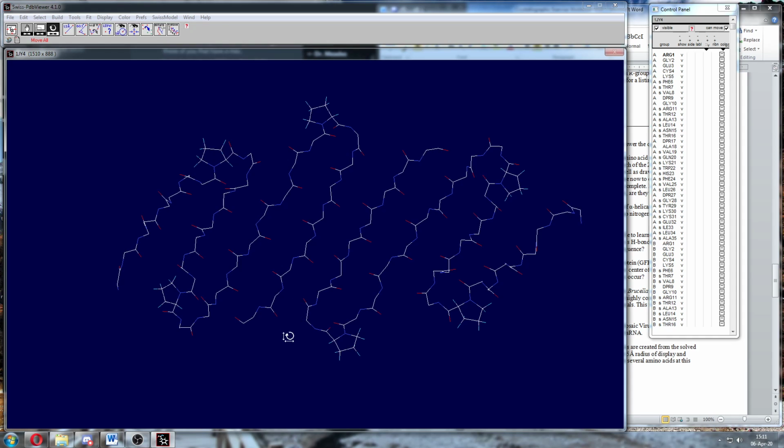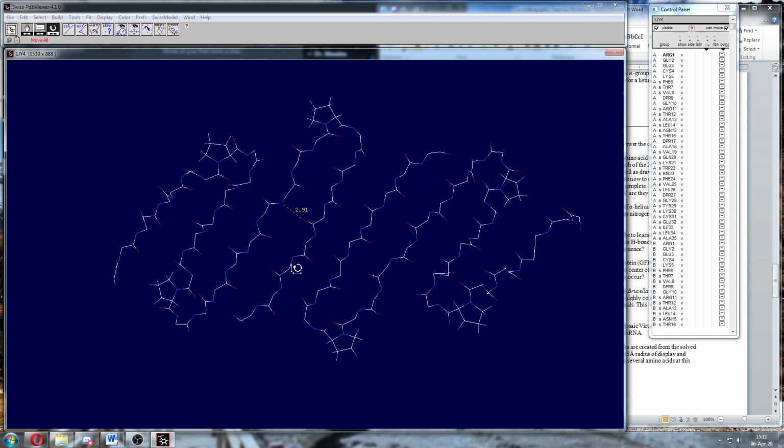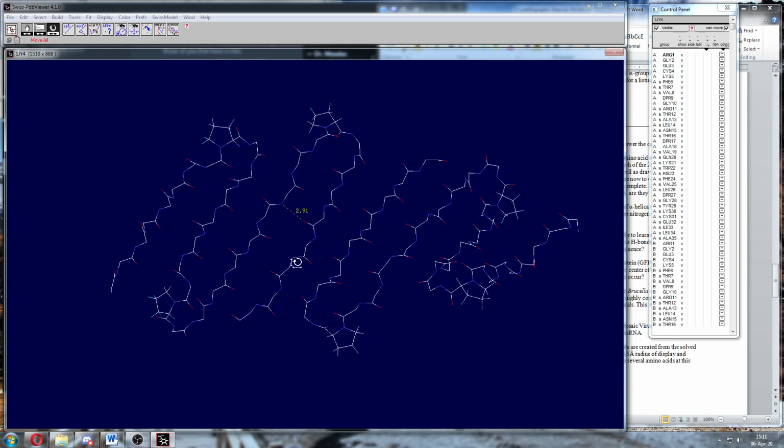Same as for the helix. Right, same thing, hydrogen bonding between carbonyls and nitrogens. And if we try to get our distances between any two of them, we'll see it's, again, hydrogen bonding length. However, there is no formula this time, right? Because this strand could run off and do who knows what before it comes back and pairs with the strand it was just leading. So there's no formula like an alpha helix of n hydrogen bonding to n plus 4. No such mathematical relationship exists here.